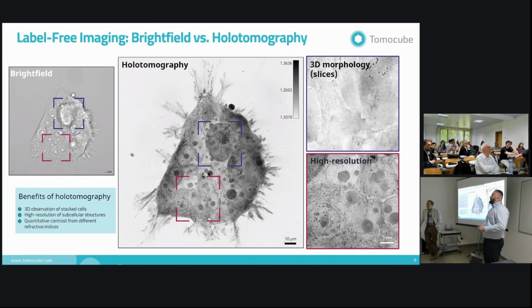So acquisition takes, if you do time lapse, you could image every 6 seconds once in the position. Processing to see this image takes about 30 to 40 seconds depending on the Z itself. So if you image every 7 seconds, you're going to have a backlog of the processing because it's computational reconstruction. You need to process all those images, times 150, or whatever the quick math is going to be. To reconstruct that is going to go into the GPU of the computer to give you this information. So that's 6 versus 30 to 40, so about 5 times more time taken to reconstruct the data.